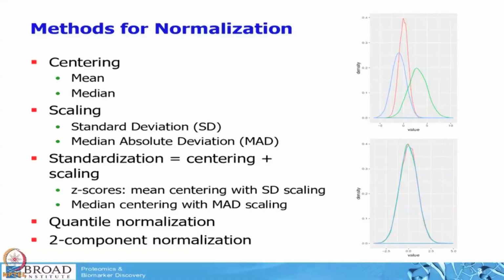So if the log 2 ratio is 2, that means that protein was 4-fold upregulated compared to your reference. Whereas if you are on the negative side, then that protein was significantly downregulated compared to your reference. The reference is kind of the average, so something that's very different from the average is what is going to affect your analysis. If there are little mismatches in the middle, I think it won't be too much of a problem. But what you need to be careful about are the tails. And we will talk a lot more about tails when we go to the other 2 types of normalization listed there.